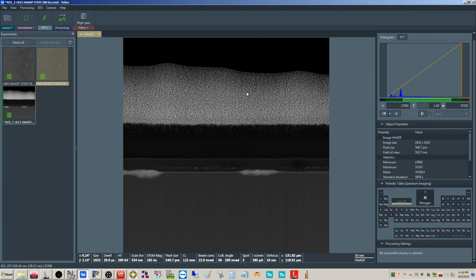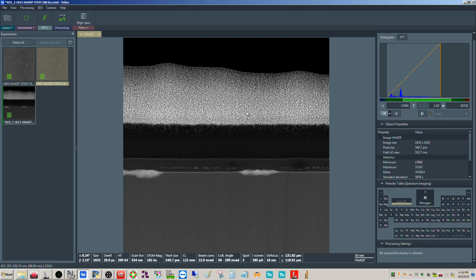And then if you save this, so I just did Control S, then it will export it with these contrast limits, okay? Otherwise, if you just have it on auto levels and you save it, then it's going to export it with the auto levels contrast limits, okay? So you can keep that in mind. So that's the quick hitter video I wanted to share with you about adjusting your contrast and brightness.